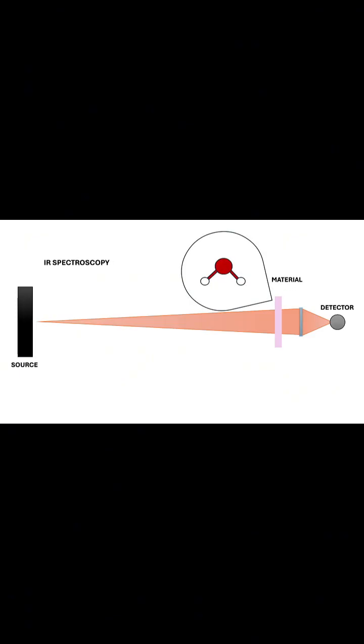Fourier transform infrared, or FT-IR, spectroscopy involves the passing of infrared light through a material to measure how much infrared light they absorb. This method is largely similar to a regular IR spectroscopy, where infrared radiation interacts with the sample through particular frequencies that result in molecular bond vibrations. Long story short, FT-IR spectroscopy still uses the same principle of identifying the frequencies at which functional groups vibrate, but is able to differentiate and separate for a broader spectrum of frequencies.